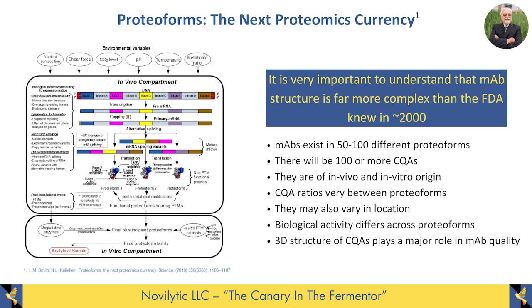It's many types of molecules. Some of them will be biologically active and some not. And so the whole issue is to determine what percentage of all the molecules that are made, the so-called monoclonal antibodies, would actually be biologically active, would be therapeutically effective.